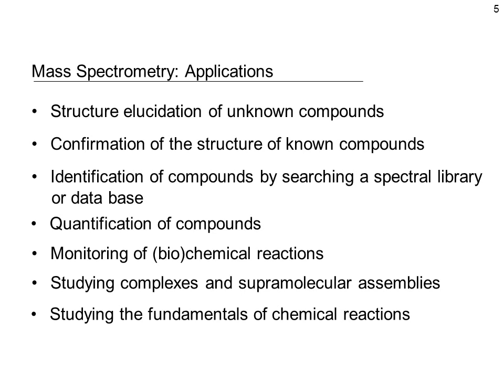Studying complexes and supramolecular assemblies is a recent use of mass spectrometry. It was long thought that it was not possible to study non-covalent supramolecular assemblies. However, if conditions are chosen and the ionization process is gentle enough, one can even bring complete viruses into the mass spectrometer, collect them on a plate, and after that infect mammalian cells with these viruses.